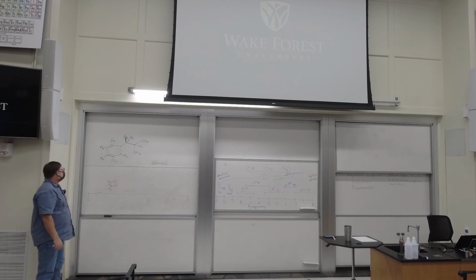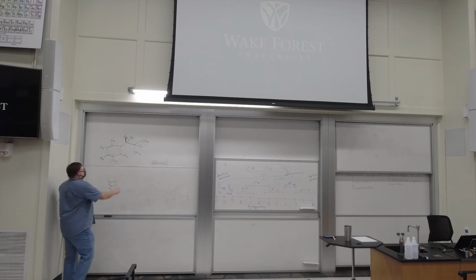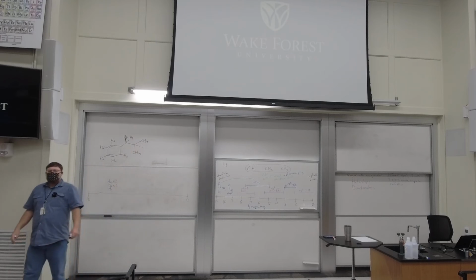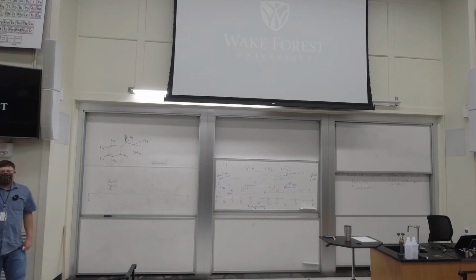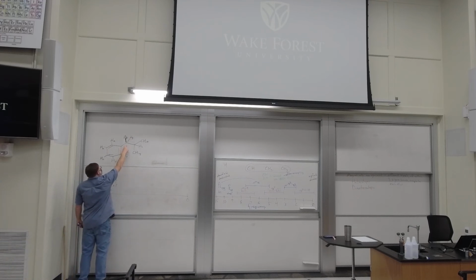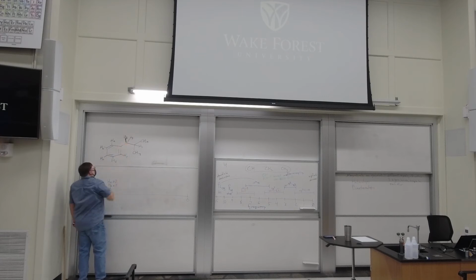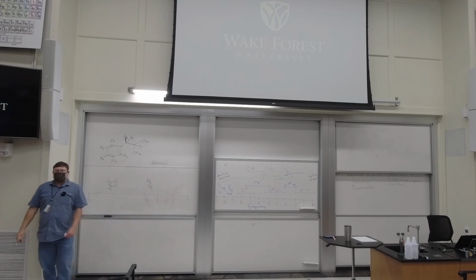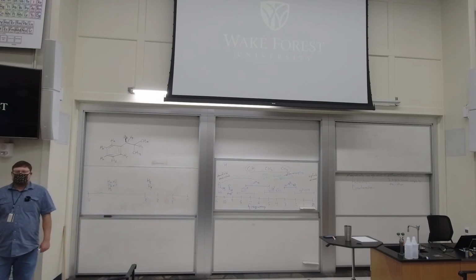All right, so if we look down here, this is all just sort of sp3 carbons bonded to other carbons. But there's one in particular, HF and HG, proton on an sp3 carbon bonded to an sp2 carbon. So HF and HG would come right in there.